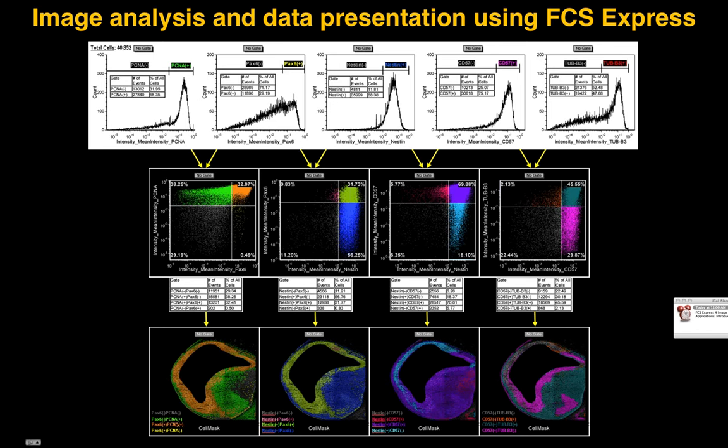And why is this important? Because just because PCNA is a marker of proliferation does not necessarily mean that it's unique to stem cells. Other cells can proliferate inside the brain as well, or progenitor cells as well, and it's definitely nice to combine these markers to identify specific phenotypes of interest and the state of their differentiation or proliferation.